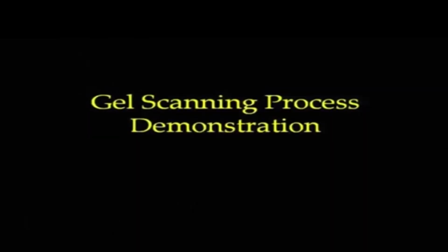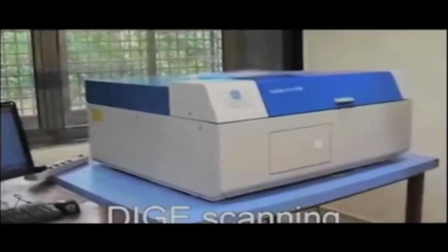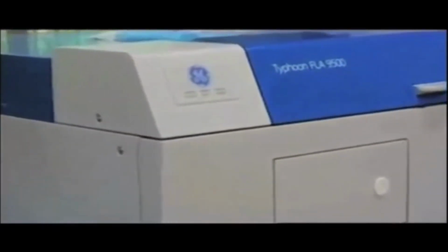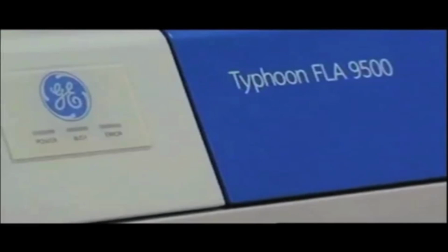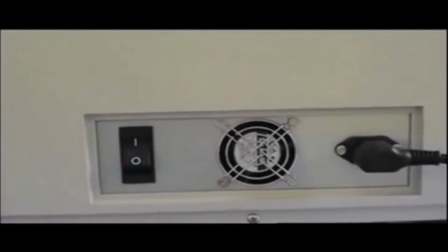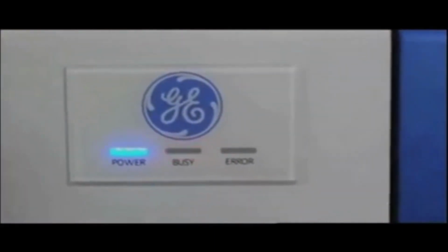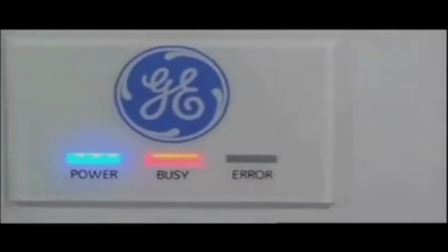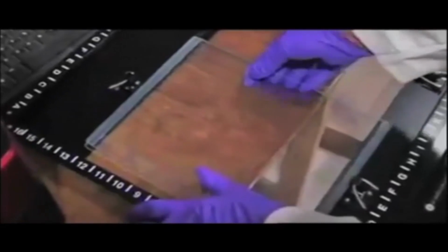Dye gel scanning. 2D DIGE gels will be scanned using a Typhoon variable mode imager at a 100 micrometer resolution, employing suitable excitation emission wavelengths. Switch on the Typhoon scanner. Place the gel plates on the tray provided as shown and insert it in the Typhoon scanner.